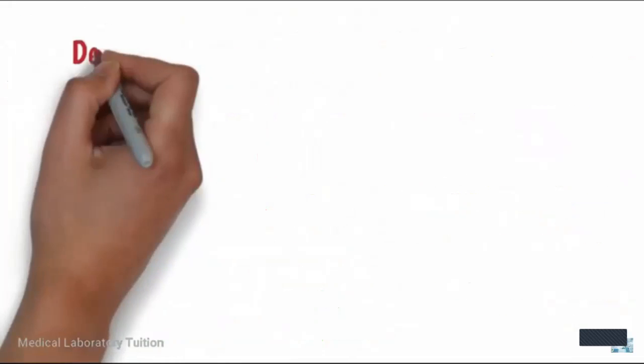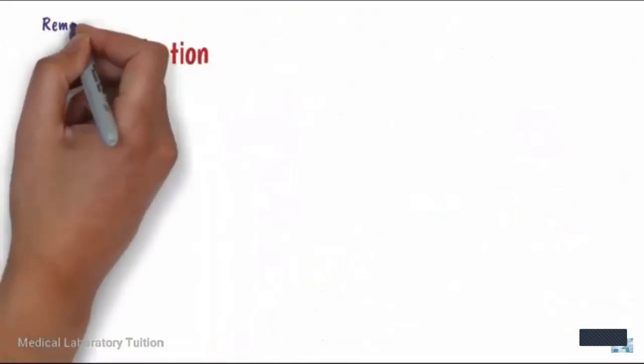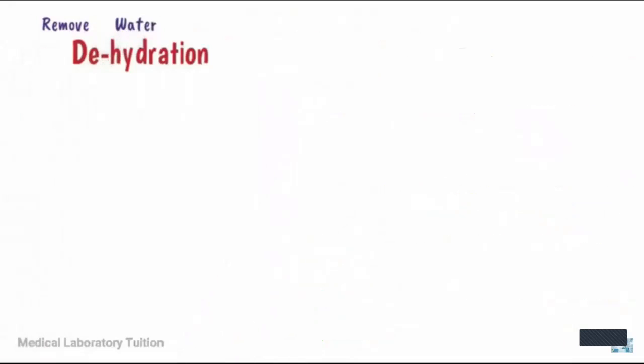Another step is dehydration. De means remove, hydration means water.